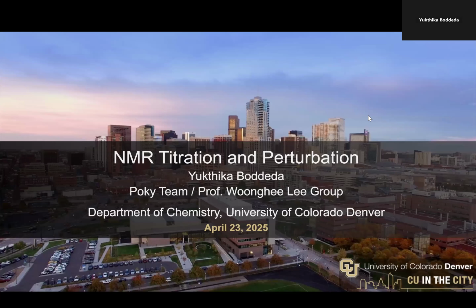Hello everyone, my name is Yukthika Boddeda, and today we'll be looking at NMR titration and perturbation. NMR titration is a method used to study protein-ligand interactions and to measure binding affinity of different binding factors through measuring chemical shifts of residues present in the particular spectra or experiment.